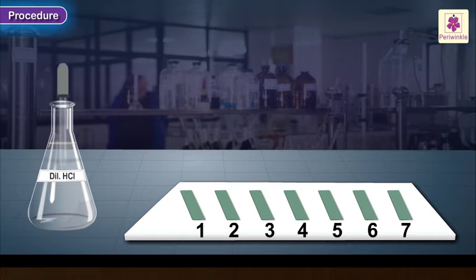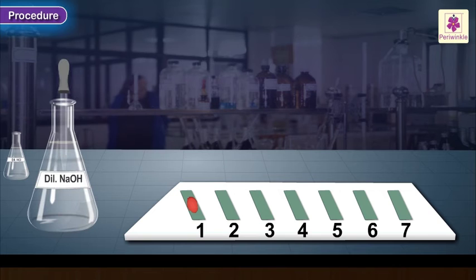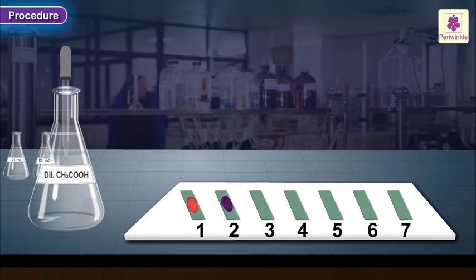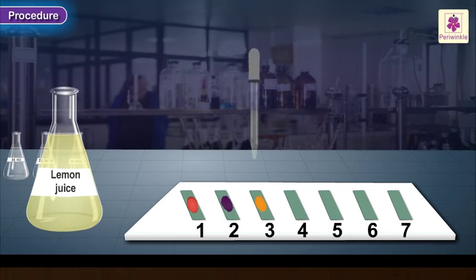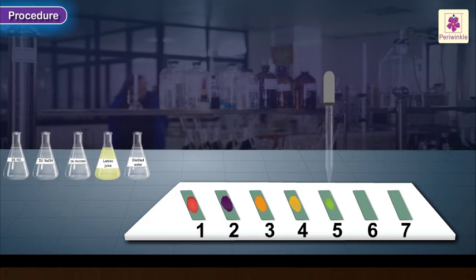Use a clean dropper to place two drops of the first test sample, dilute hydrochloric acid, on the first piece of the pH paper. Use another dropper and place two drops of the second test sample, dilute sodium hydroxide solution, on the second piece of the pH paper. In the same manner, place two drops of each solution separately on the pH paper strip of the corresponding number.